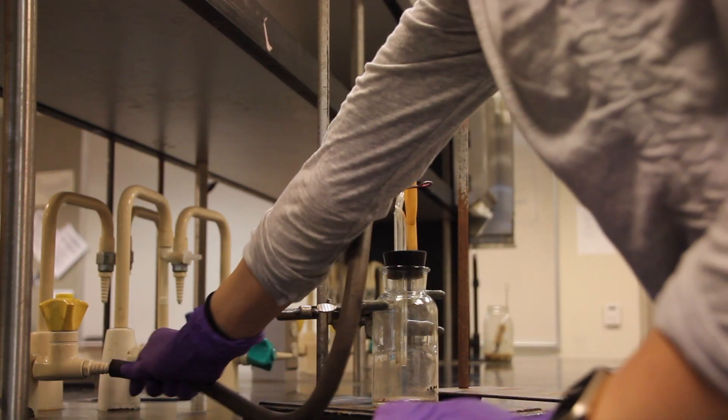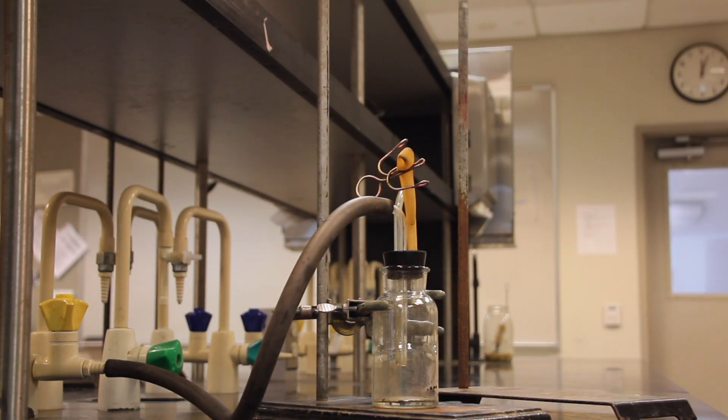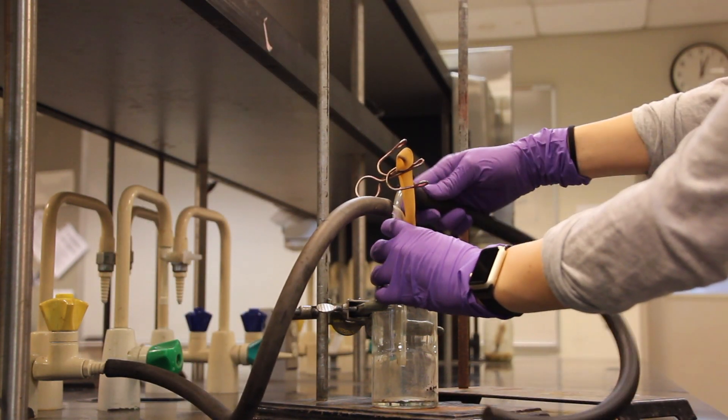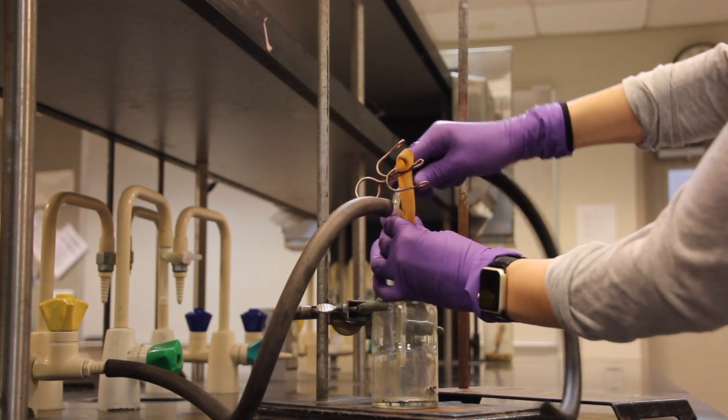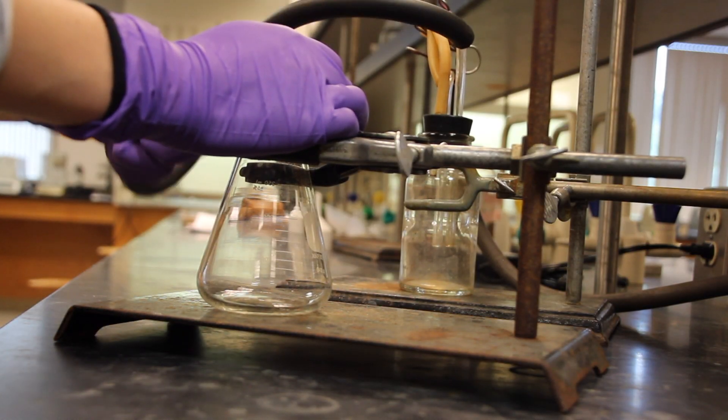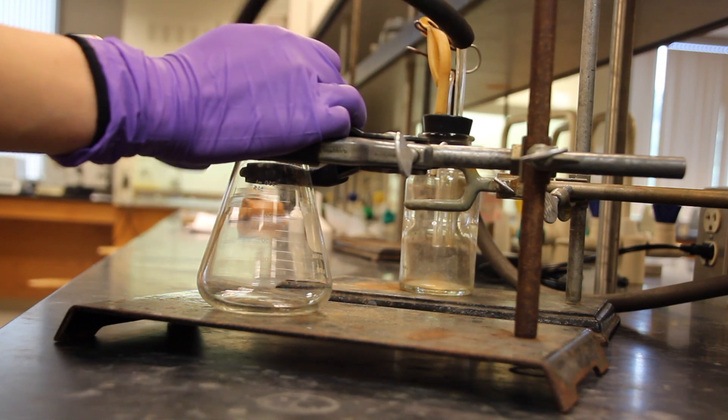One side of this vacuum tubing will be connected to the lab's vacuum system. The other side of the vacuum tubing will be connected to the clamped vacuum filter flask.